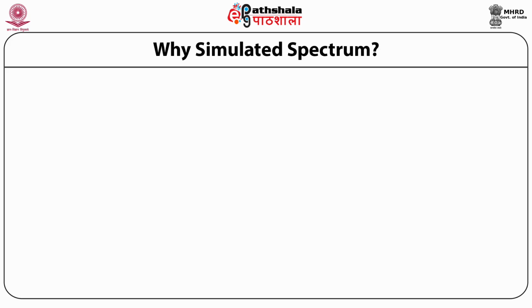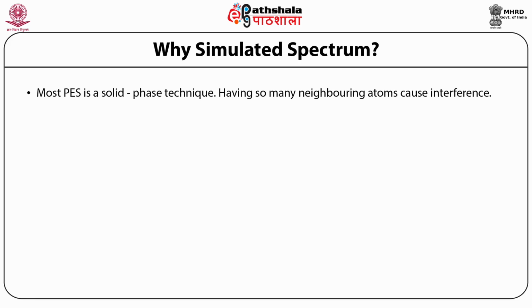Talks about why simulated spectrum. Where is the necessity to have a simulated spectrum? Most photoelectron spectroscopy is a solid phase technique. Having so many neighboring atoms will cause interference.